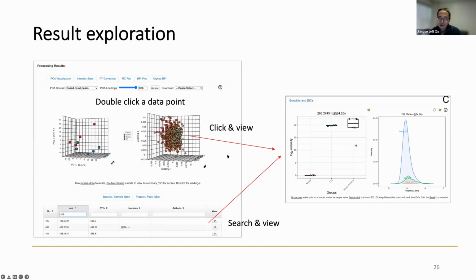After that, you don't want to just download the result. You should continue to do the data analysis. So when you're finished, you click this page. We see the PCA overview, and this is the features, this is samples.